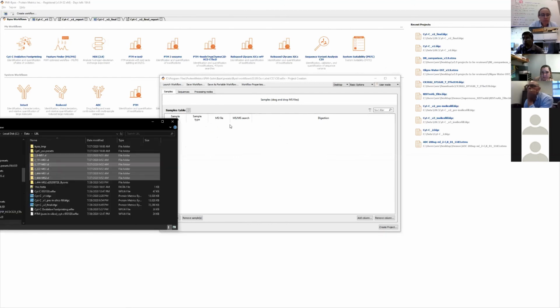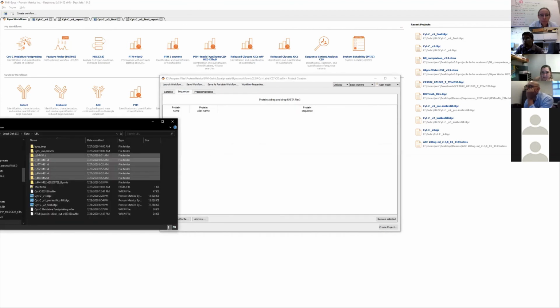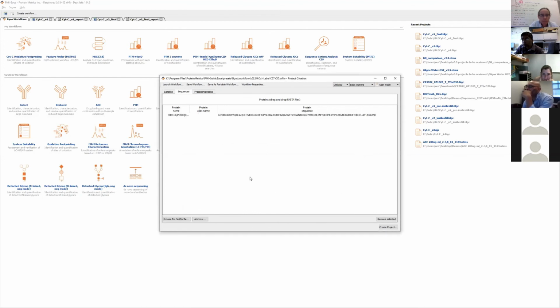And same deal. So in the first tab, you drag and drop all your raw data files, just as the other one. This one doesn't have, of course, a built-in FASTA file, so you bring in your FASTA file that has your proteins, however many there may be. So everyone except Lisa Jones, okay? Because Lisa is looking at thousands of proteins, not one or two.